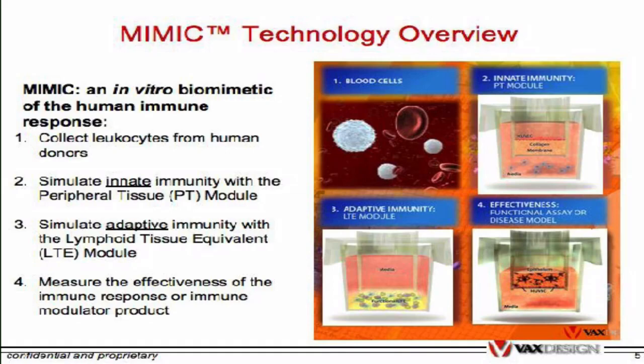So we have such a diverse population of our donors that we feel that we get a representative sampling of how population dynamics are in response. So we hope this will help faster cycle times for discovery. We certainly see that it can enable down selection of vaccine candidates, and it's certainly a new way of designing clinical trials. And as I mentioned, it reduces the time and cost involved.